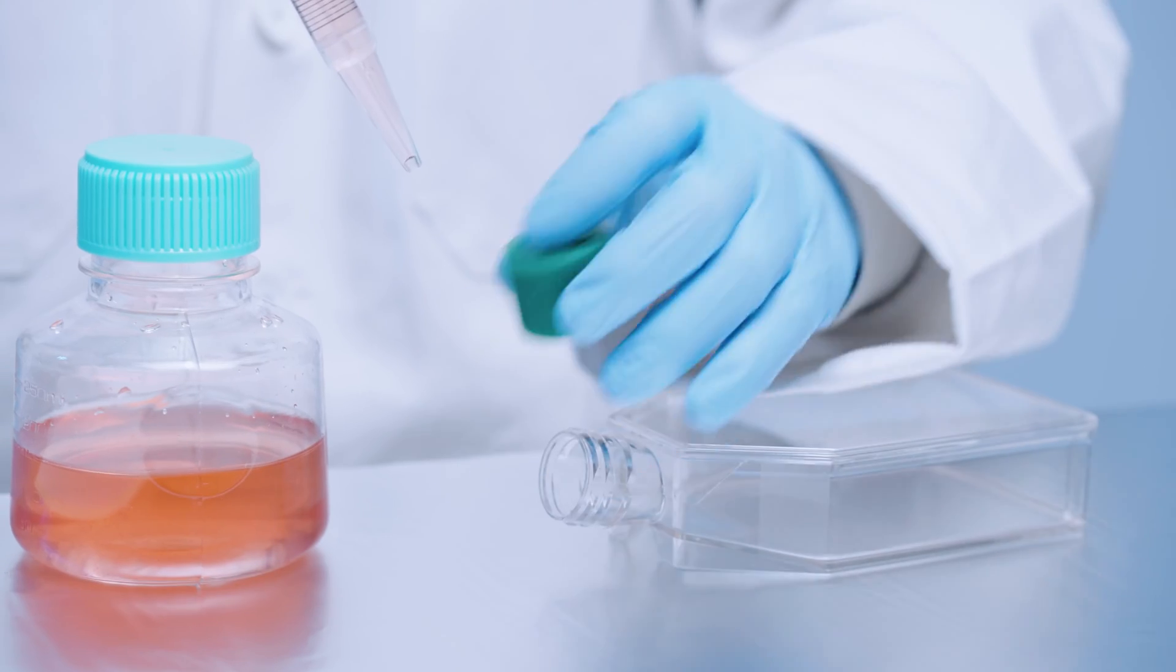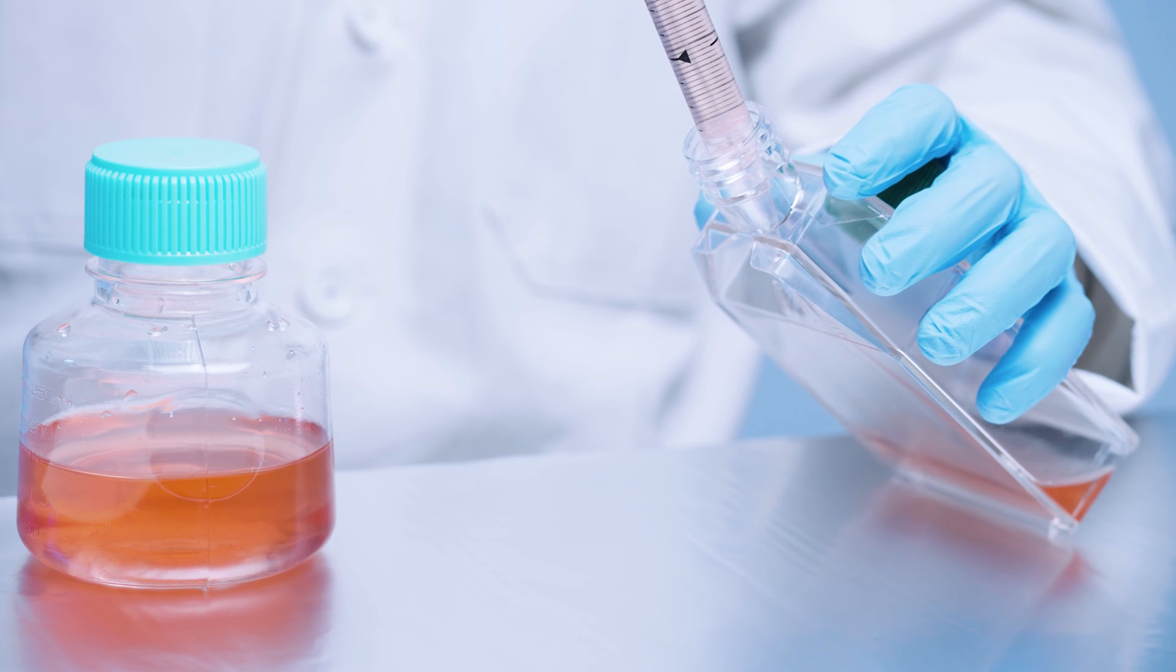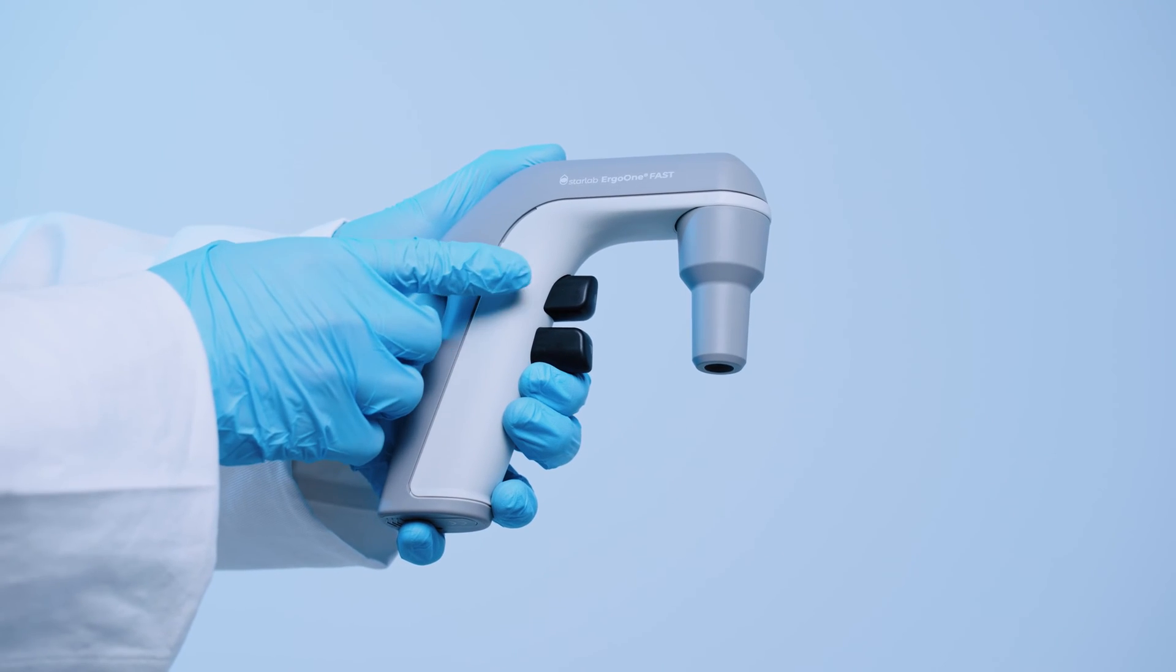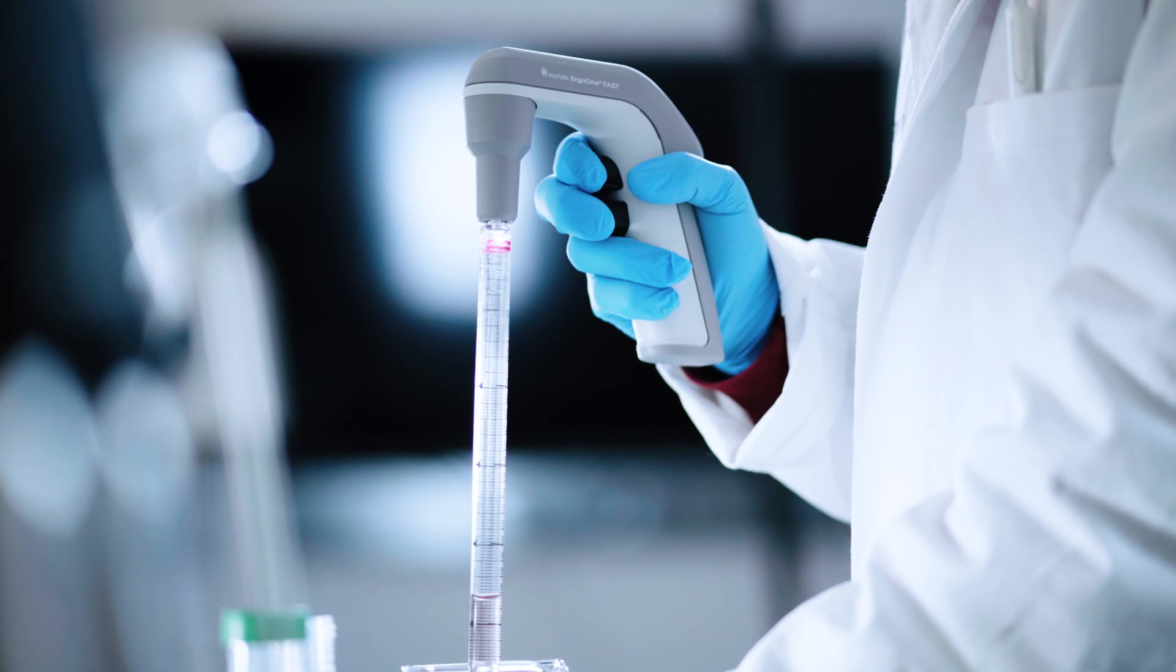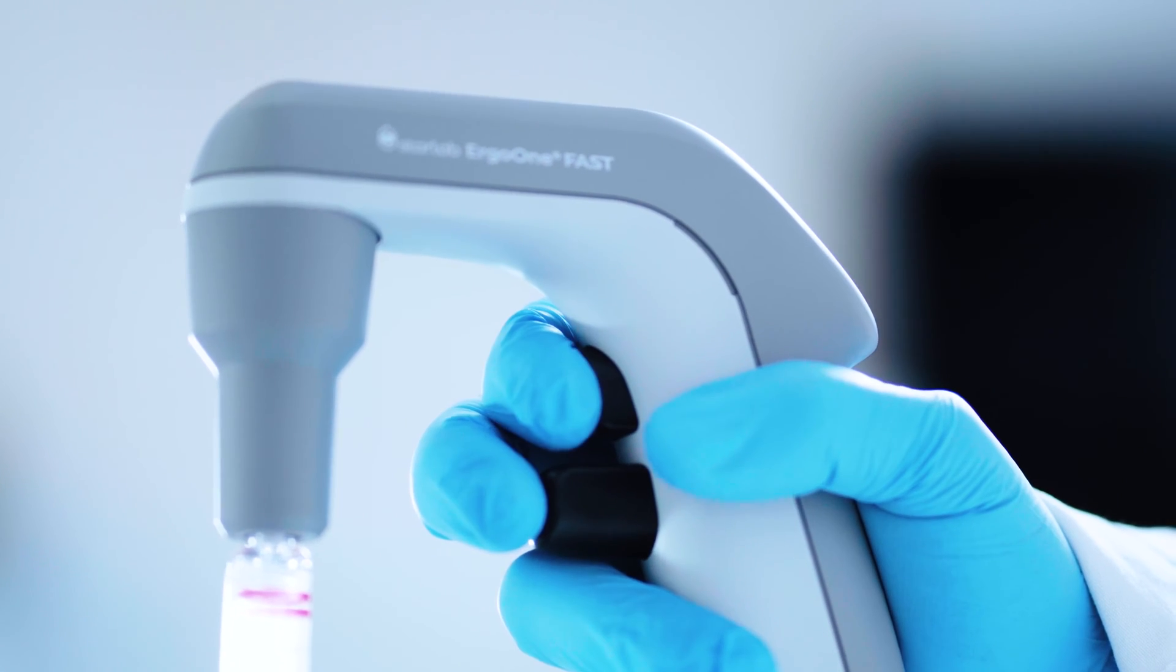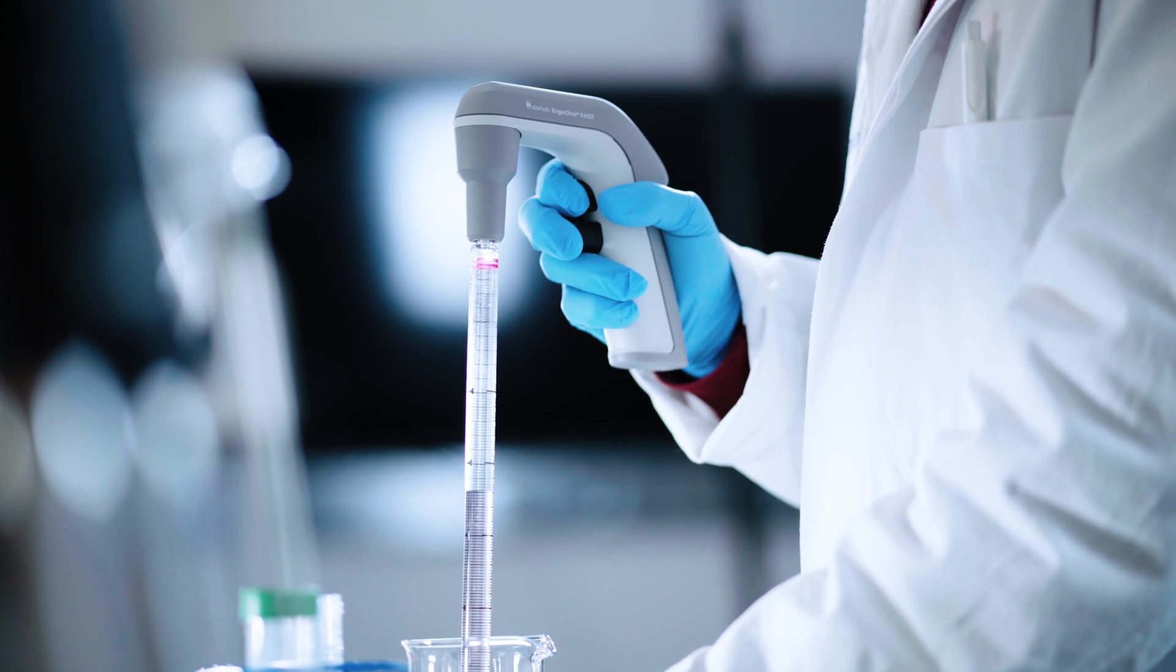The ErgoOne Fast is super easy to use. Let's walk through how to easily regulate the dispensing speeds with the user-friendly pressure-sensitive control buttons. Gently does it for slower aspirating. Just press more if you want to go faster. It's that easy.